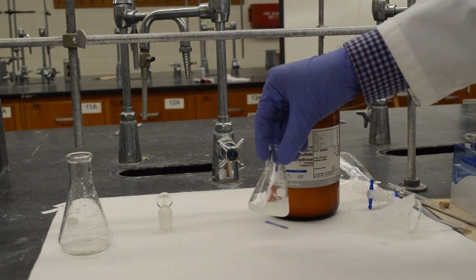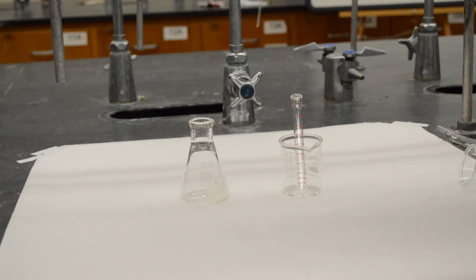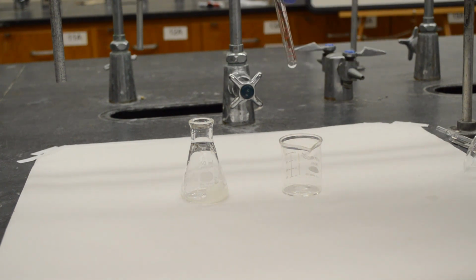Give it a swirl and let it sit for 5 to 10 minutes. After about 10 minutes of drying, now transfer the liquid, the organic phase, from this flask into a clean, dry test tube. This is a different one, it's a new one.